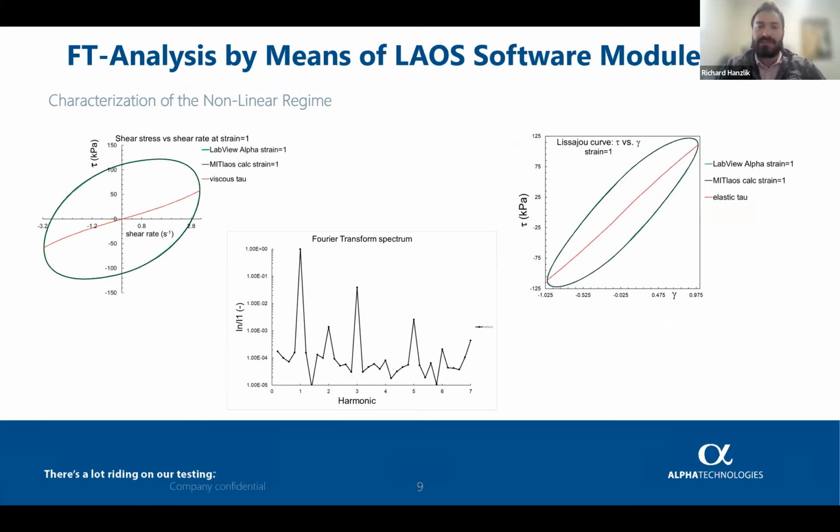So the Fourier transform rheology via LAOS is probably one of the most sensitive test methods to characterize nonlinear response of viscoelastic materials in a shear or viscometric flow, and is probably the best way to quantify the level of LCB, or long chain branching, in polymers.